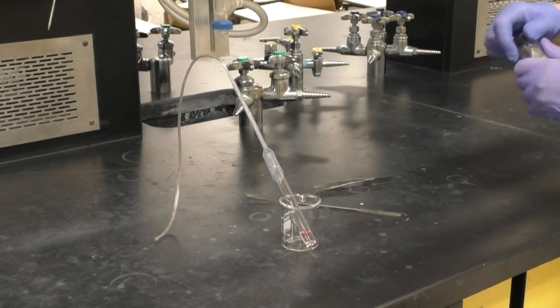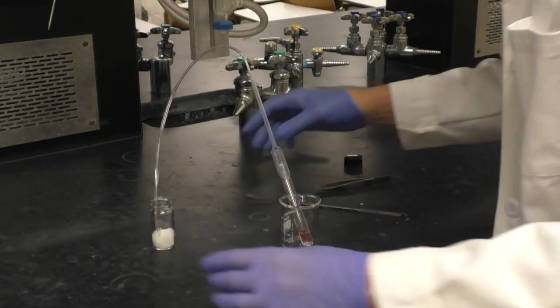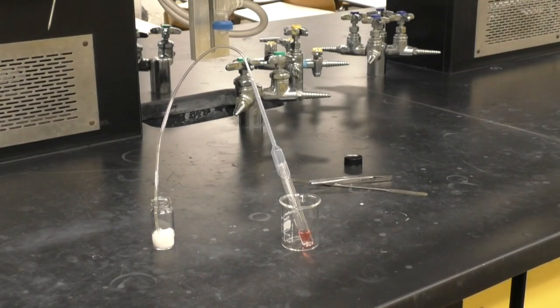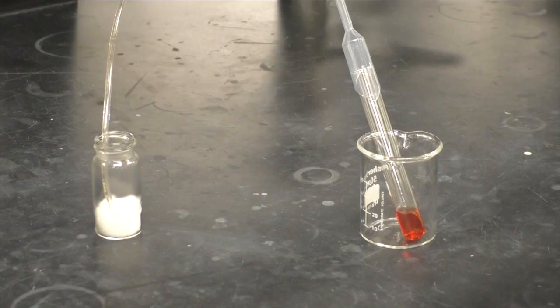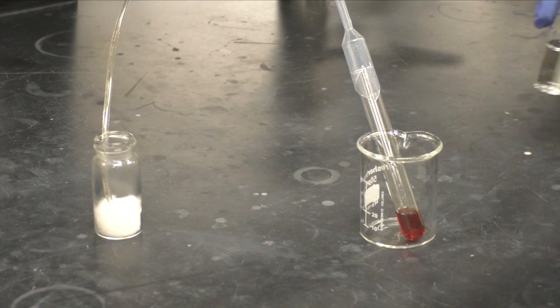Once bubbling begins, connect the test tube to the gas trap and place the end of the Tygon tubing into the saturated cotton ball. Allow the reaction to proceed until all bubbling has stopped. This will take about 15 minutes. You may swirl the reaction to ensure completion.